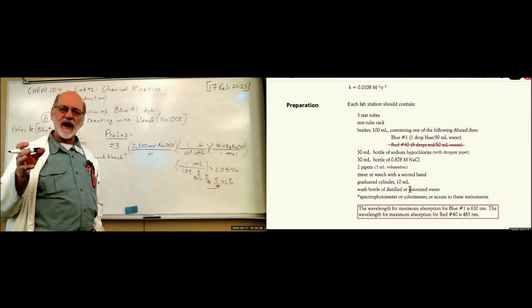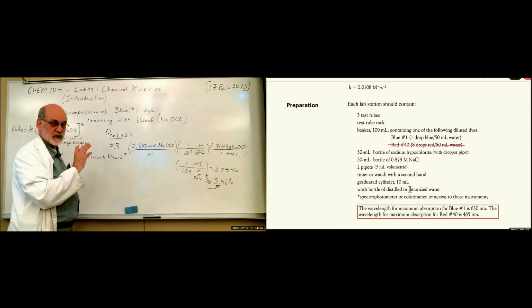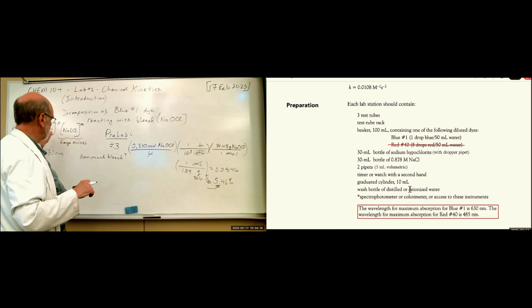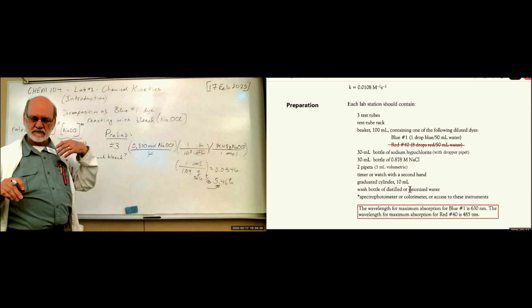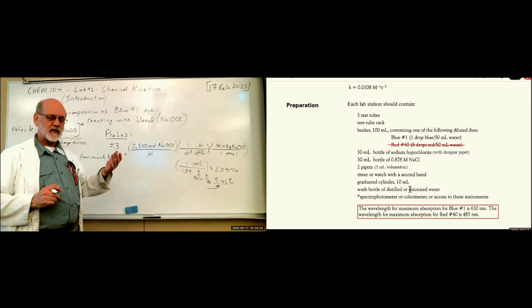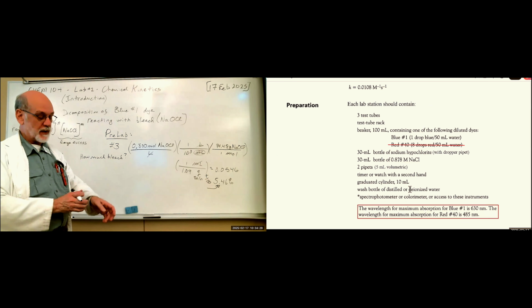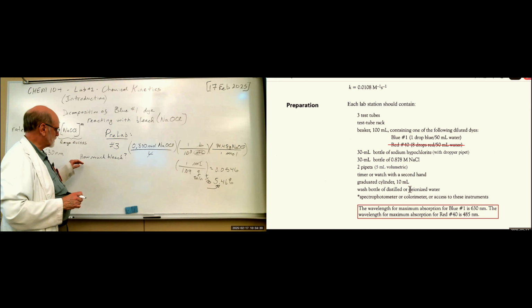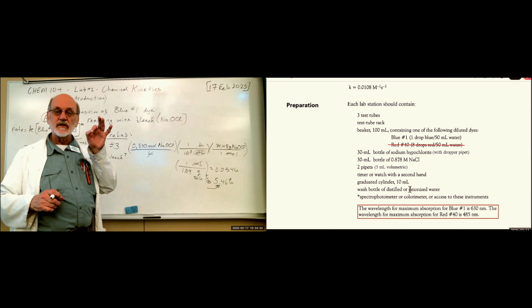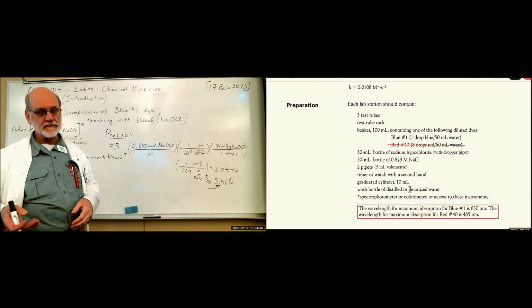How much bleach is required to decolor your blue color? So we're going to have a certain concentration of the blue color, and that's already been prepared actually, so that you don't go over the limit of your spectrophotometer. And then you want to test how many drops of your bleach are required to decolor in a certain number of minutes.